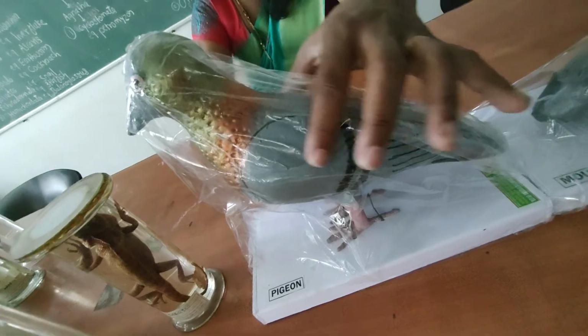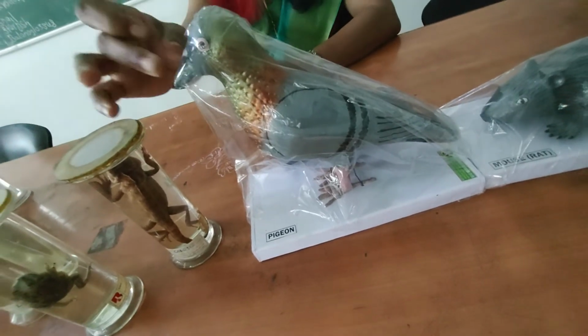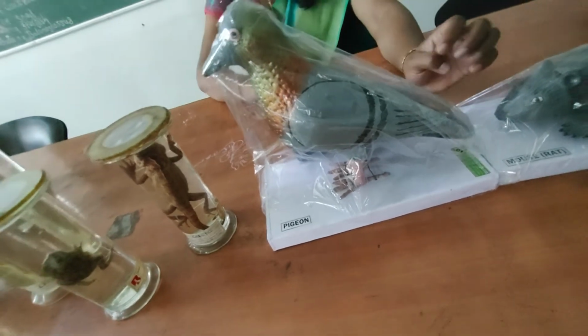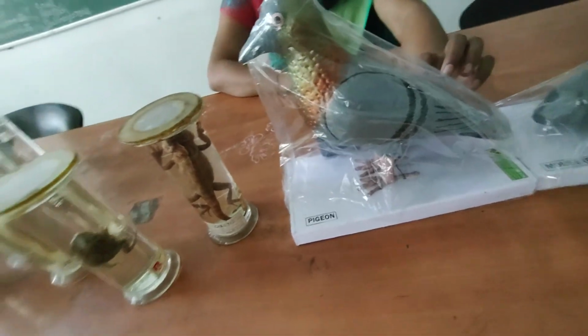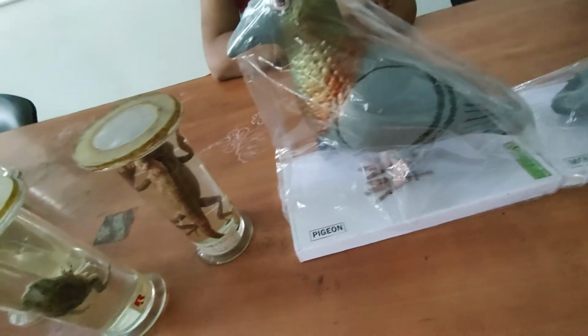The body shape is streamlined, as you can see here. Teeth are absent in their jaws. Their jaws are modified into a beak, and they do not have teeth. As special characters in the digestive system, the crop and gizzard are present.